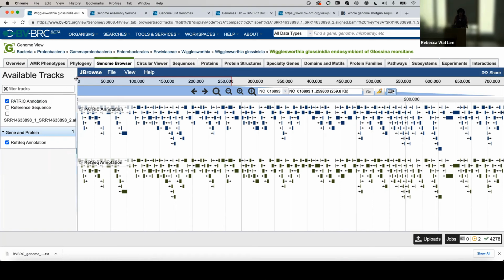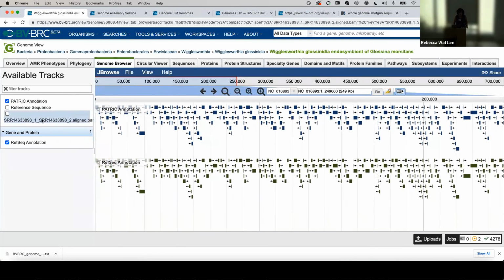And you'll notice that, I want to bring the box over. You'll notice that it's got those aligned reads there, the BAM and the .bai file. The BAM file are actually the reads. The .bai file is important for this browser to be able to see them. Now, if I click on that right now, it's going to be a mess because it's too much data.